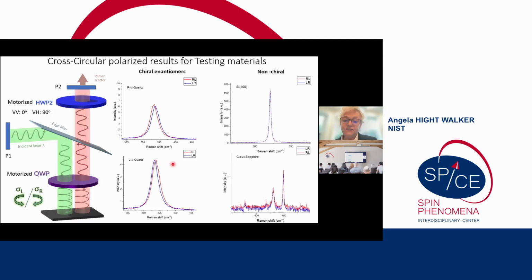And what's important here is that using quartz, the resolution of your spectrometer is less important. Of course, there's the beautiful work on HGS and other samples. What we're seeing in the literature is some people's instrument isn't able to spectrally resolve it.